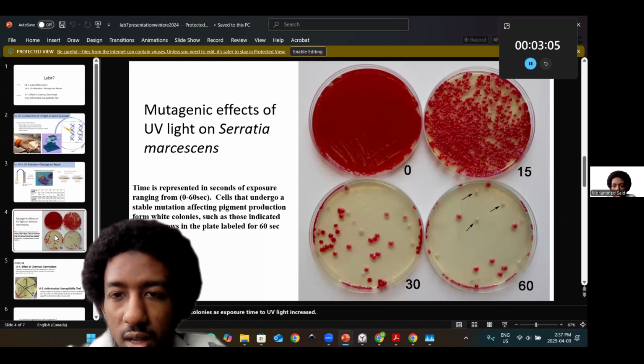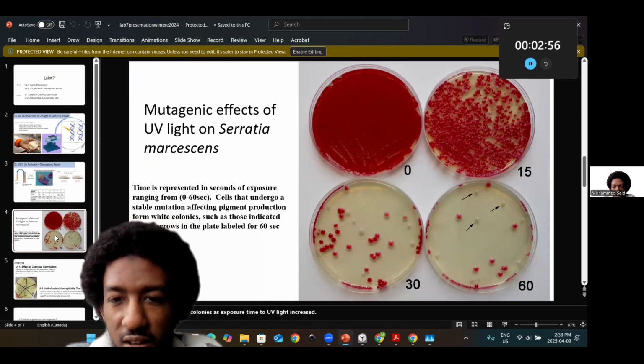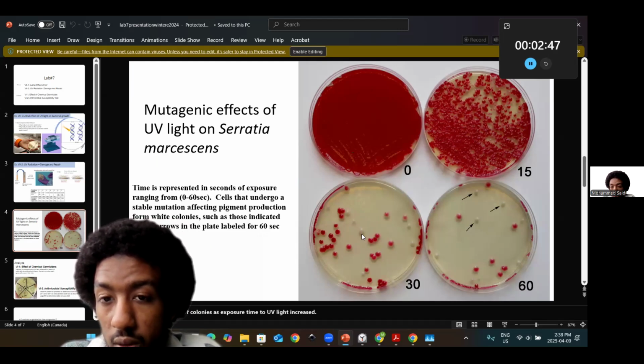So you have nonetheless a slide that's similar to Micrococcus roseus, having a reddish hint, but this is more red indeed. And so something that's quite distinguishable actually, and maybe some of you would have seen this or appreciated that, there could be the appearance of white colonies.